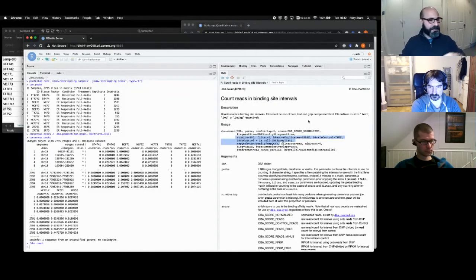Have I changed my chromatin in this area of the genome? And actually having the exact boundary isn't important. If you can get an area that is enriched in the center of that, and be comparing those across all of your samples, you're going to get a better signal for what's differential and guide you to the right parts of the genome. That's our concept.